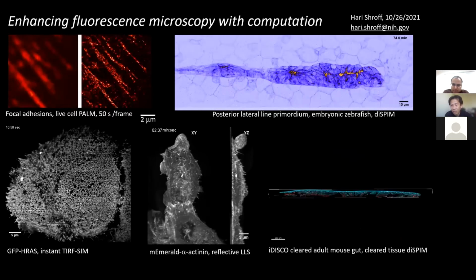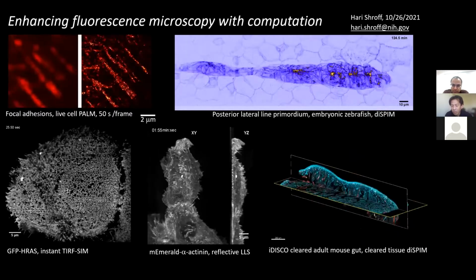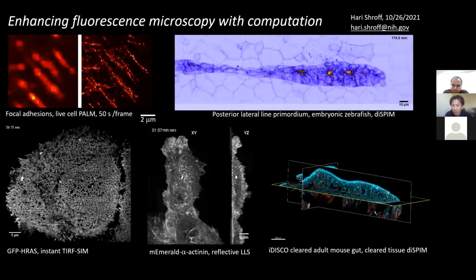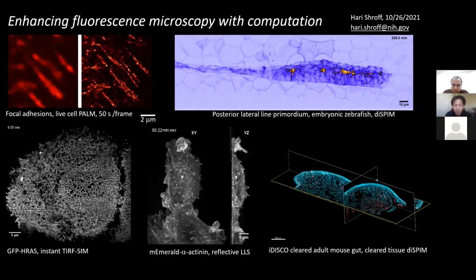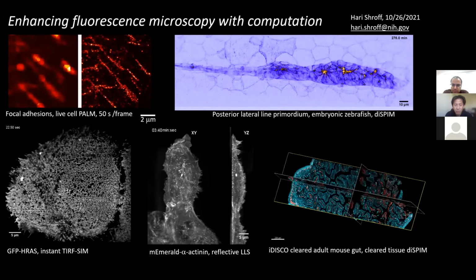I think one of the challenges in microscopy, apart from having just these beautiful images, is that we do face issues with phototoxicity and long-term imaging. So computational tools have really helped and advanced a lot of those techniques at the moment.